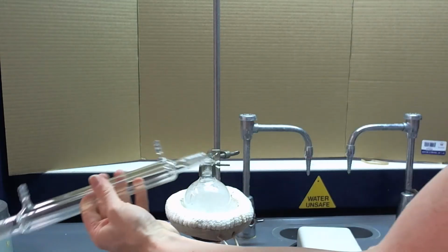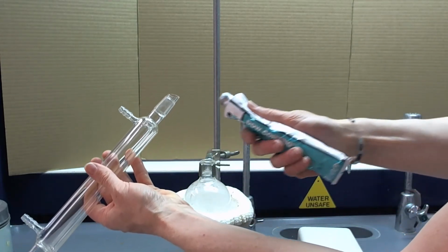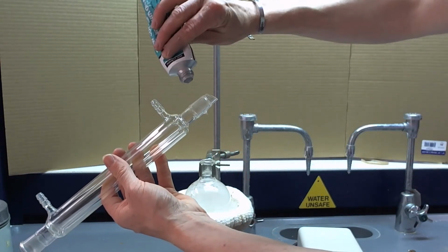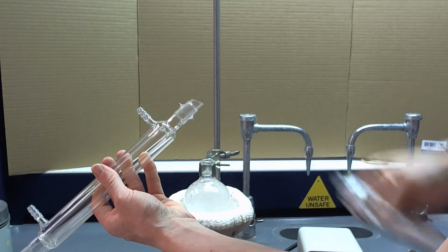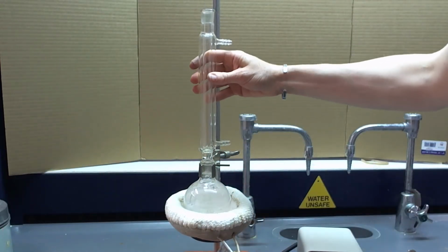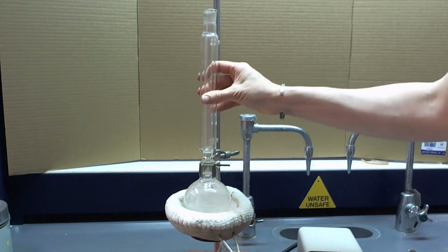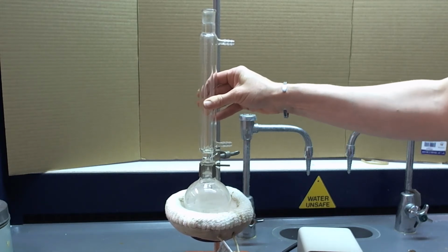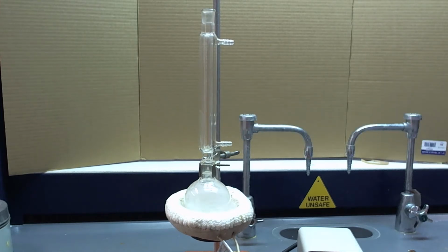So when you're getting ready to heat something, we want to grease the joint that's closest to the heat source. So one little dab of the grease on each side, about 180 degrees apart. Then you put that into your flask and then just twirl it around to spread the grease around. Gives it a nice firm seal.